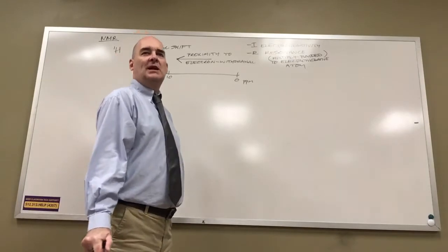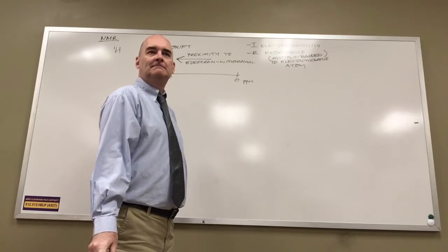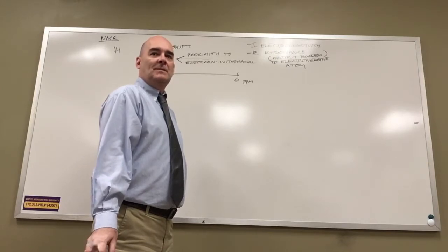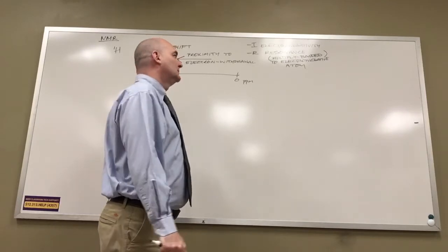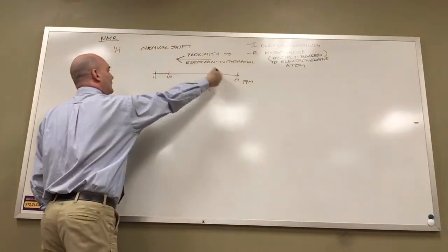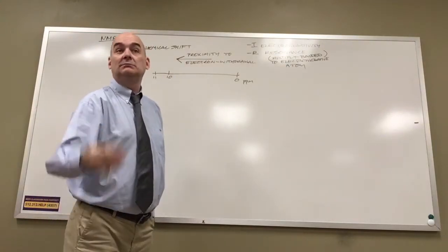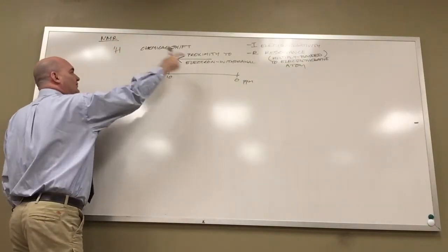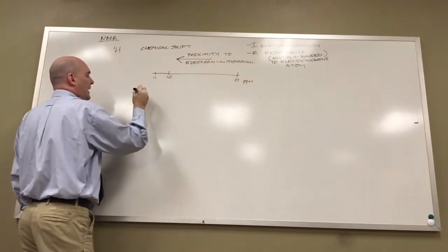How would we recognize an electron donating group? The atoms double bonded to the ring directly. Electron donating groups have lone pairs of electrons. Electron withdrawing groups are multiply bonded to electronegative atoms. So proximity to electron withdrawal pushes my signal this way by a process called deshielding. We'll do the theory tomorrow. Today is application, tomorrow is theory. Chemical shift tells me frequency, tells me how close to electron withdrawal I am.